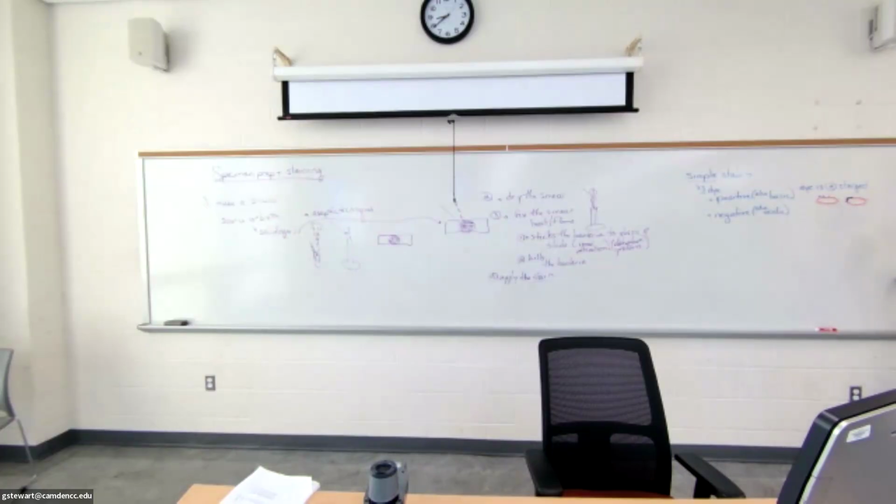On my diagram here, I'm just drawing it on the outside, but remember, bacteria are 3-dimensional, so really the whole thing is covered in blue. I know the bacillus looked better than the staph for us the other day.